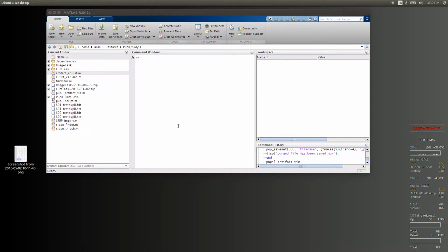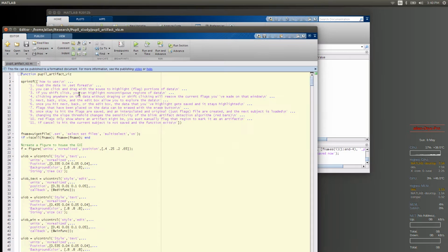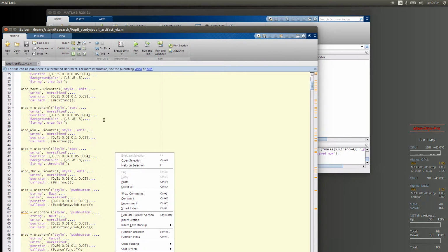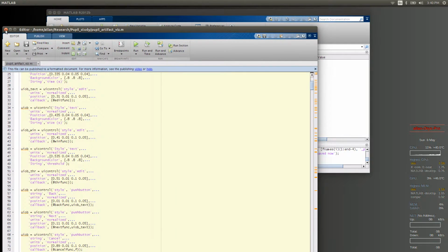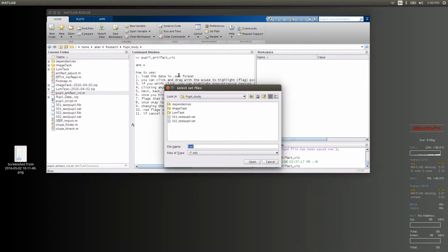Okay, hey Melissa, this is a training video for the new pupil artifact viz function. So this is the function here. You're pretty familiar with it already. The new features now, I'll run it for you. You get pretty much everything you asked for.